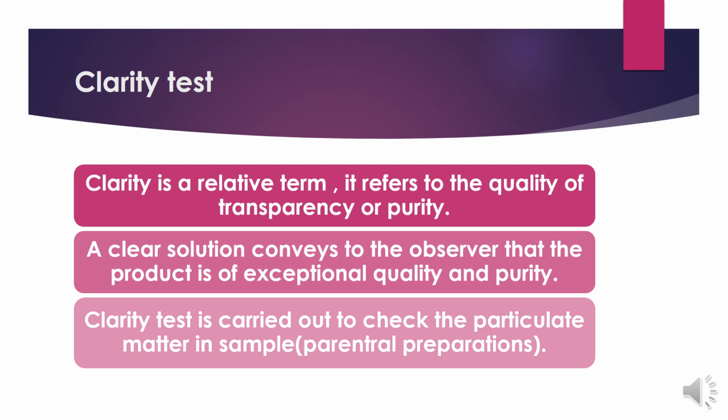So basically this test is carried out to check the particulate matter in the sample. The sample we have in this chapter is the parenteral preparation. So we are checking the clarity, meaning how clear the product is, by checking the presence or absence of any sort of particulate matter in the sample, which helps in deciding whether the product is of high quality and purity or not.